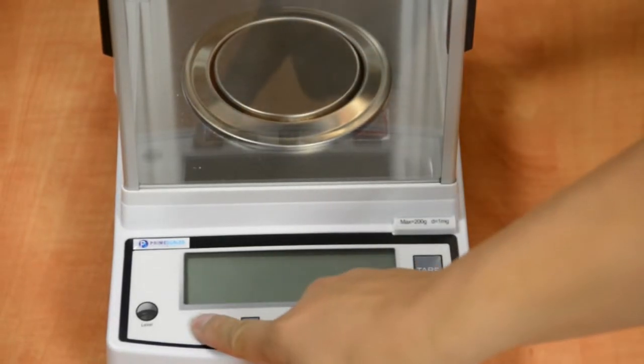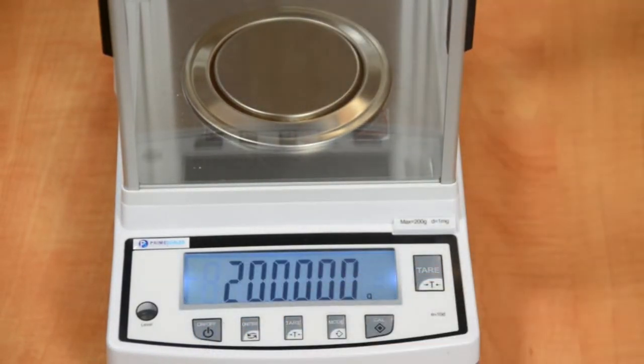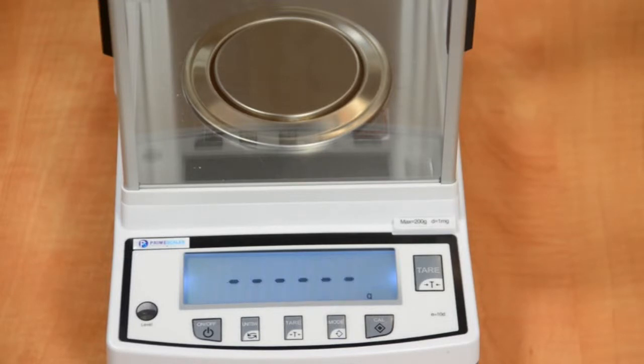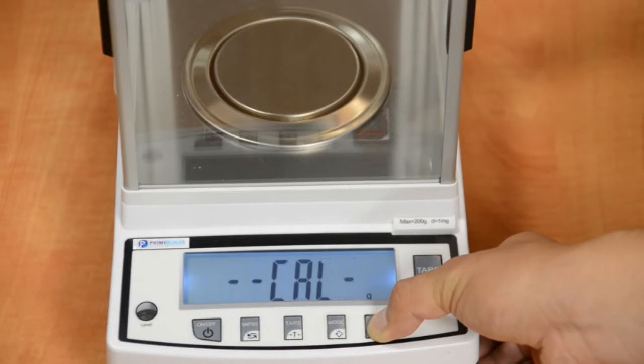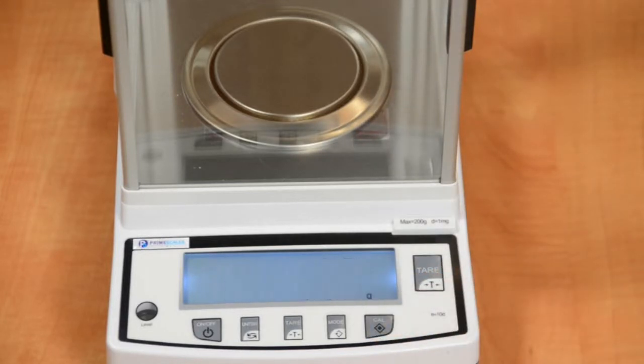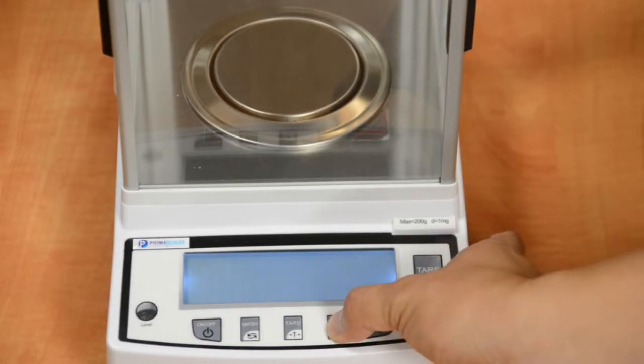Thanks to its load cell technology, the balance does not need 15 to 20 minutes warm-up time. Just turn it on and it's ready to go. When the scale stays at zero, press and hold the Cal button until the display shows Cal. When it shows a blinking number, press and hold mode until the display shows Cal again, then blinking full capacity.